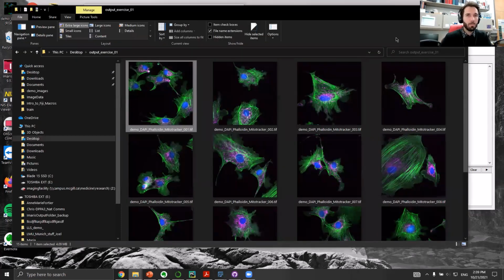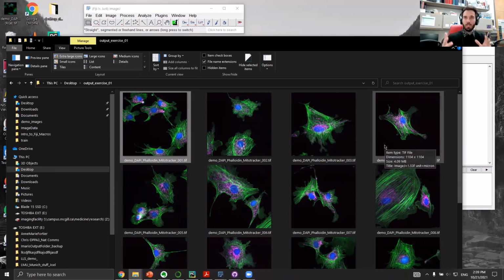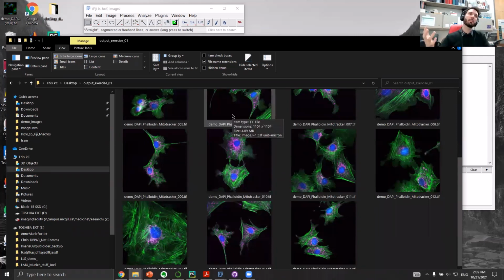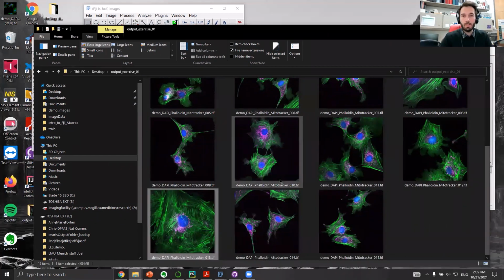And so this is surprisingly useful. One, we just went over batch processing. You can apply a function, whatever it is, to a whole folder of images. And I do recommend that you do some visualization-based processing on your images, just because it'll make your life easier down the road. So you could put this output folder in the original folder, and it's just easier in a month or two when you think, I did this staining 2 months ago, 6 months ago, something like that. I remember there was one image with a crazy cell that took up the whole field of view. Which one was it? And if you just have these little thumbnails here, it's super handy to say, oh, it was image number 13. And then you can either go back to that to do quantification, you can put it in your talk or something like that.